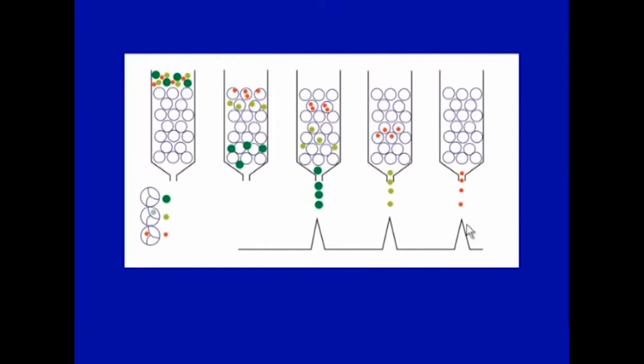Now, what I was trying to say is, why do you need a long column? You need a long column because the molecules start as a single entity when you load the column, and as they move, if you have a smaller column, the separation will not be complete, and you can have overlapping peaks. So, with a long and narrow bore column to avoid diffusion, better separations can be achieved in gel filtration chromatography. This, in a very simple way, explains the whole basis.